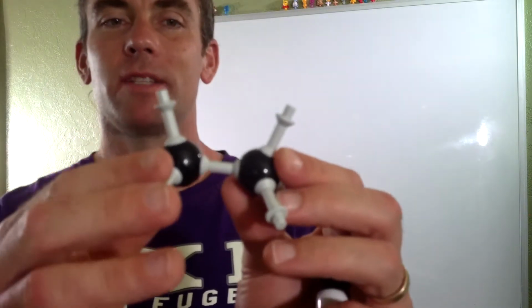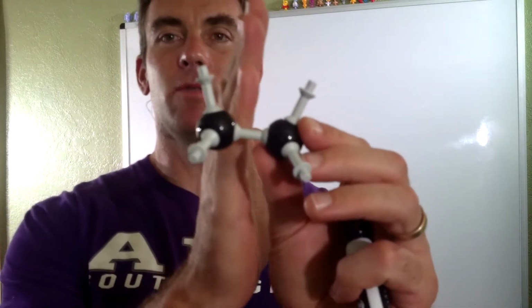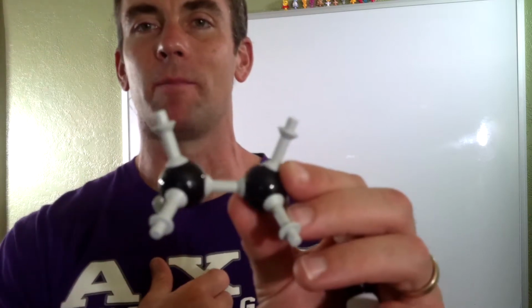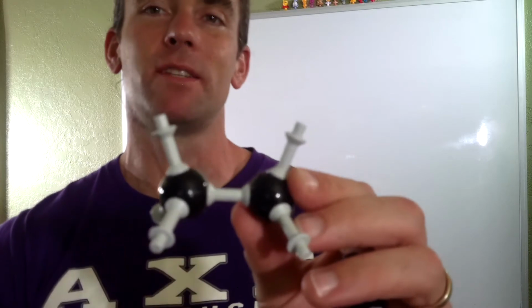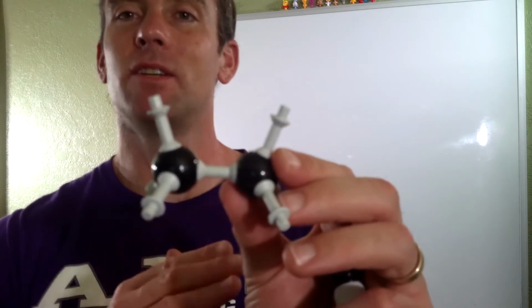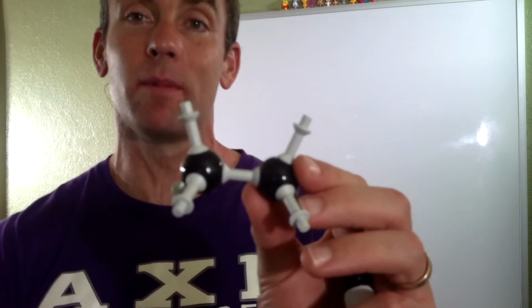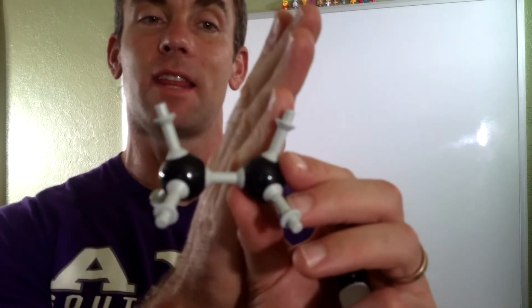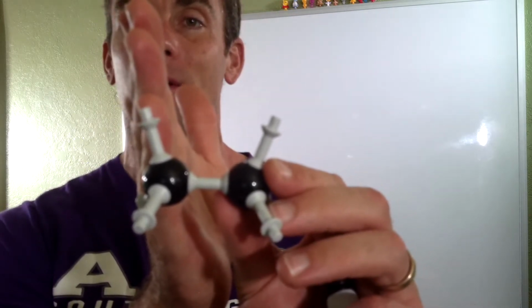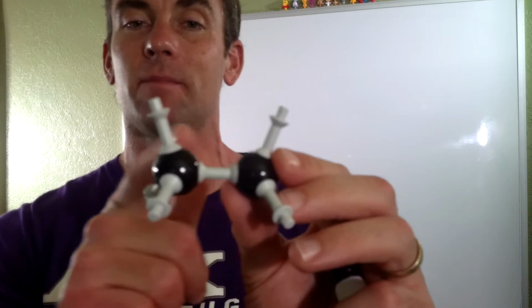One of the things you'll notice is that there's a symmetry plane that perfectly bisects this molecule, such that those hydrogens reflect into those hydrogens over there. It turns out that the basis of C13, or actually the basis of all nuclear magnetic spectroscopies, has to do with finding equivalent atoms. In this case, we're talking about carbons. So that symmetry plane that said that proton, or H, is the same as that proton in terms of its chemical environment, turns out that same symmetry plane interrelates these two C13s.